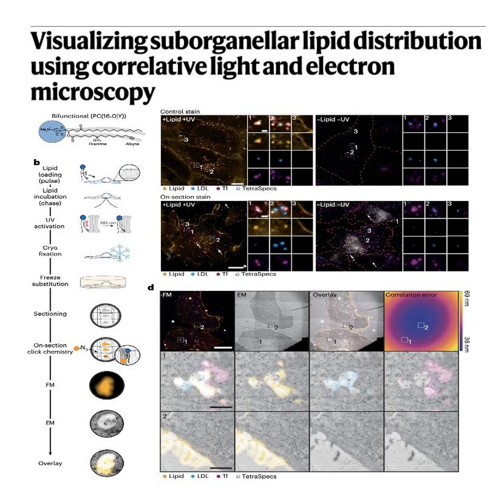Wait, 0.45 micrometers isn't the absolute resolution limit of the imaging setup, like 0.35 micrometers? Exactly. You are literally barely scratching the surface. So if HM20 blocks the reagents and prevents 3D analysis, why even bother using it? Because what it lacks in penetration, it completely makes up for in architectural preservation. It is unparalleled for maintaining the physical ultrastructure of the cell. If your goal is precise Z-dimension mapping and keeping the membrane looking pristine, HM20 is the only choice.